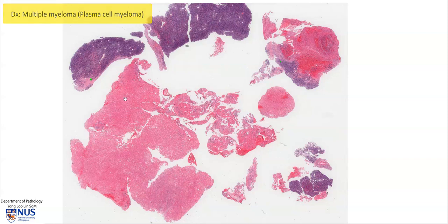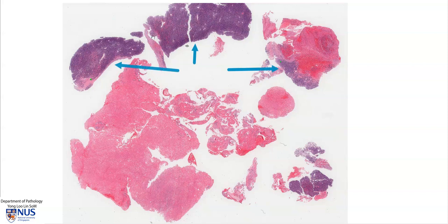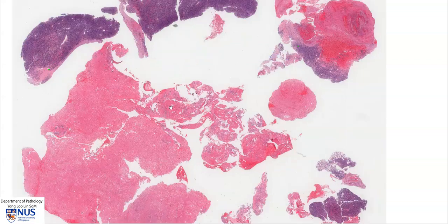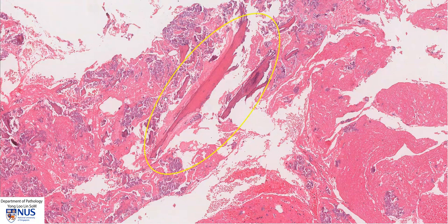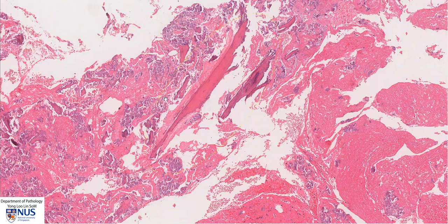We can see that there are a lot of very pink or red areas and some extremely intensely blue areas. These blue areas are where the neoplastic plasma cells are. But let's first look at the pink areas. We can see that there are some fragments of pre-existing bony trabeculae, because this sample is a curettage from the vertebral body.